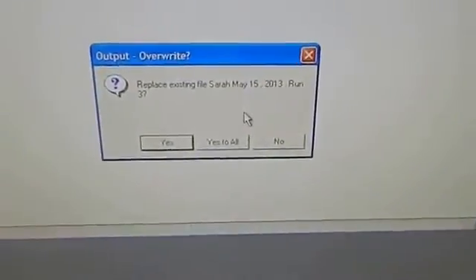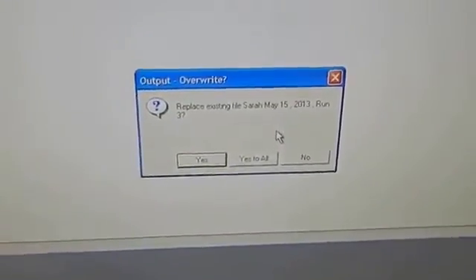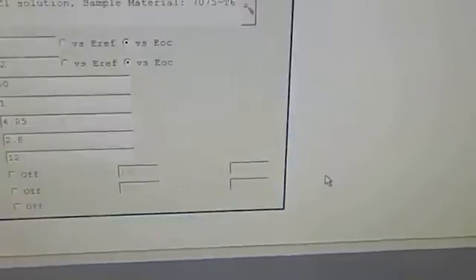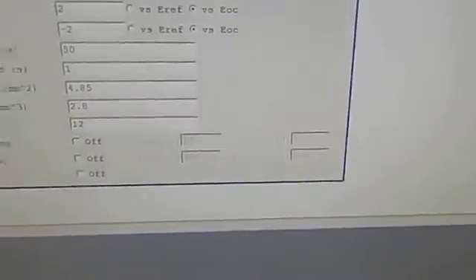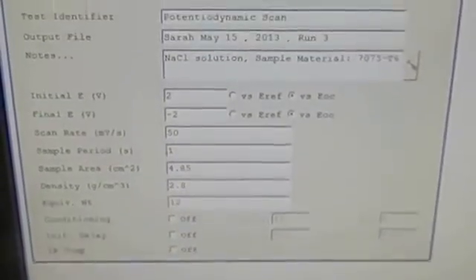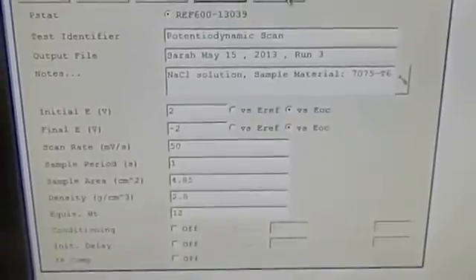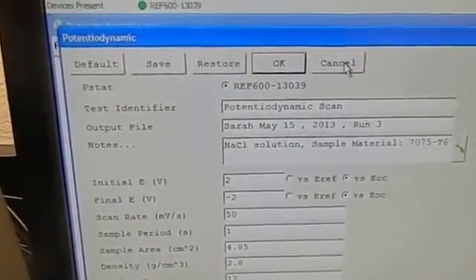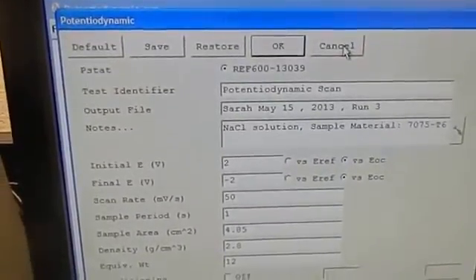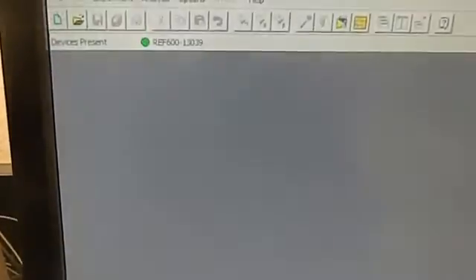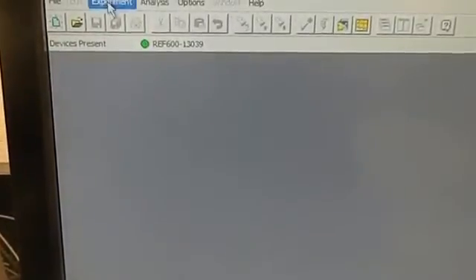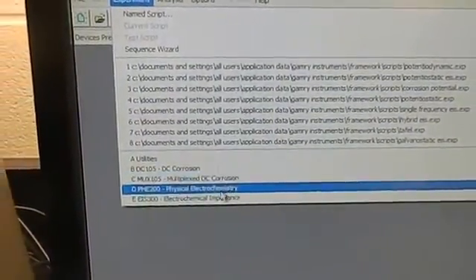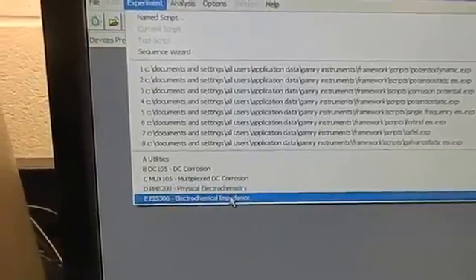This time the experiment is not going to run because we don't have any corrosion liquid, so we are not going to have any curve. This is how the potentiodynamic curve has to be done, and this is how we work on it.